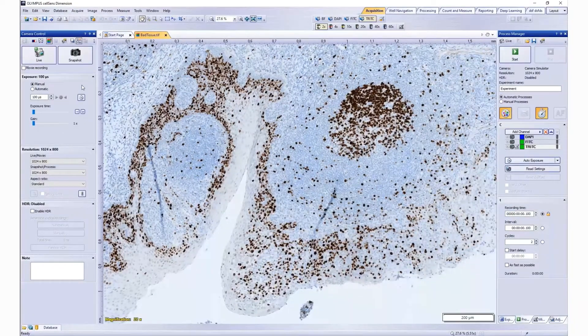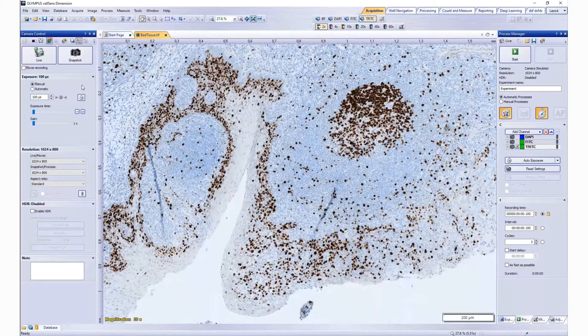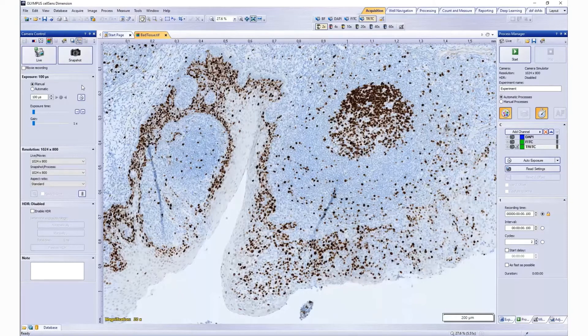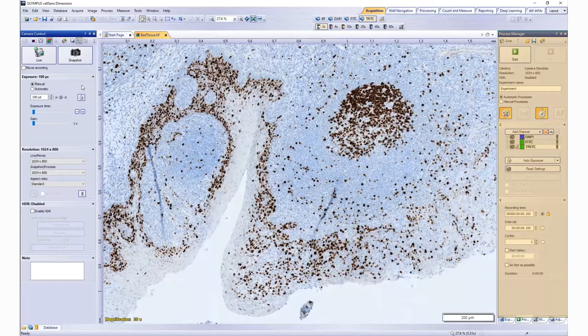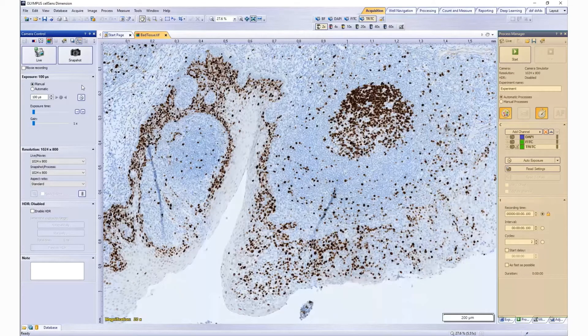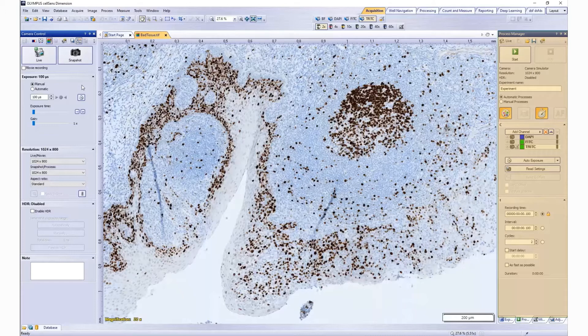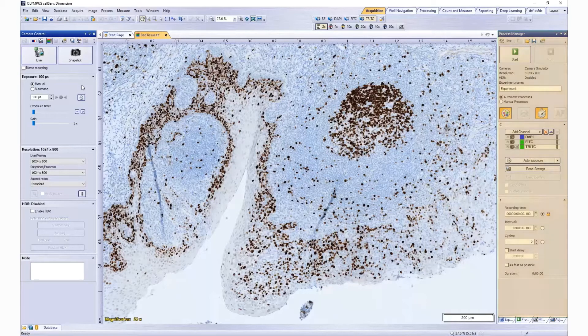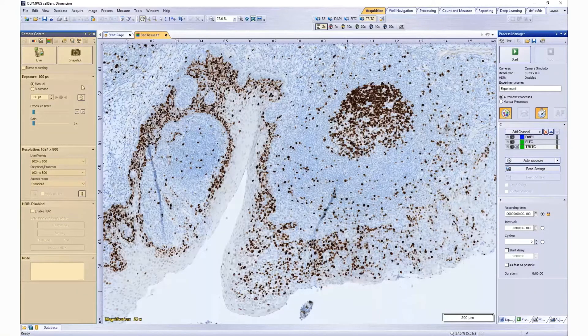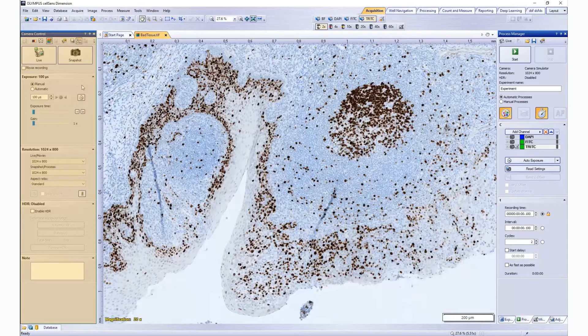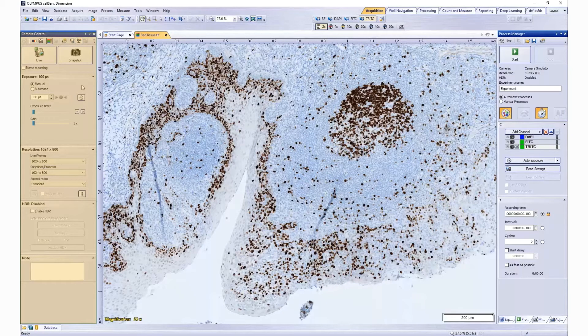Tool windows combine functions into groups, and these may be very different functions. For example, in the Process Manager tool window, you can set up unique acquisition processes like time-lapse or multi-channel acquisition, while in the Camera Control tool window combines all of the functions and settings you can use with your specific camera.